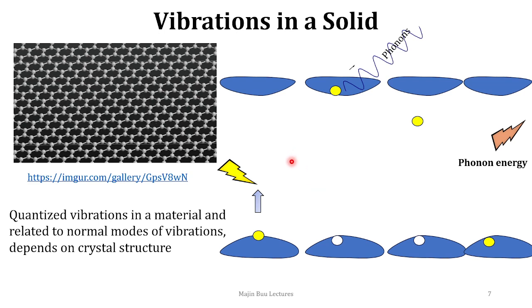While that was with respect to the electromagnetic wave, you should also consider something that is characteristic in a solid, that is vibrations in a solid. Now, quantization of these vibrations associated with the crystal lattice structure is named as phonons, and the phonon-photon interaction is going to play an immense role, especially in Raman spectroscopy, or in understanding the crystal structure of these kinds of solid materials, the crystalline material.